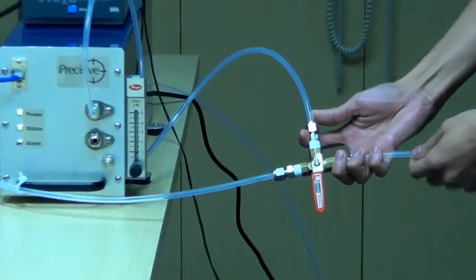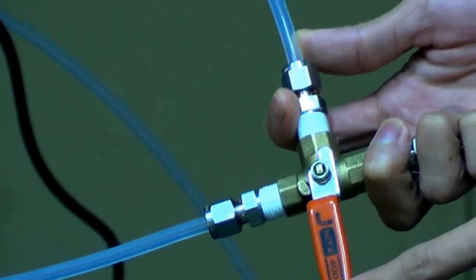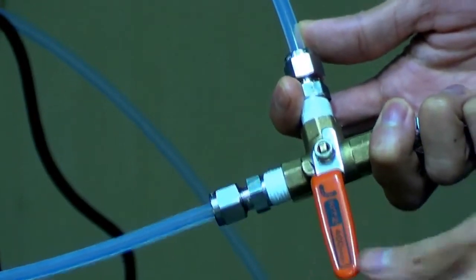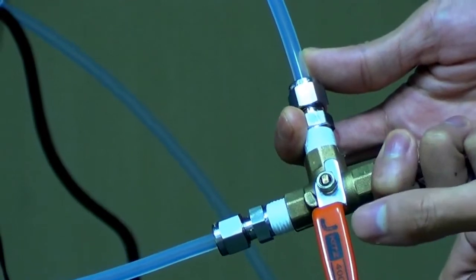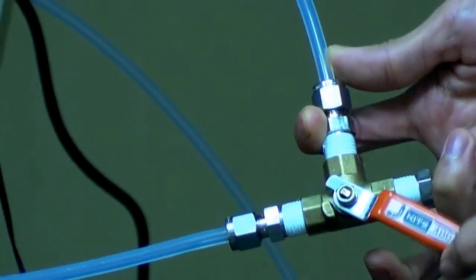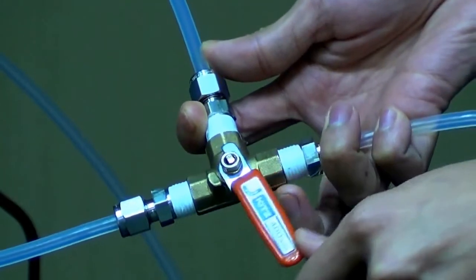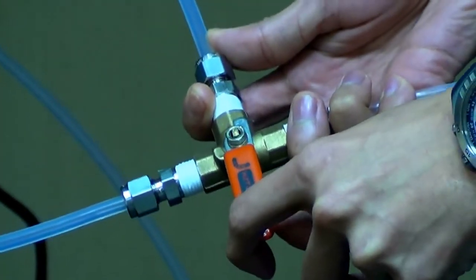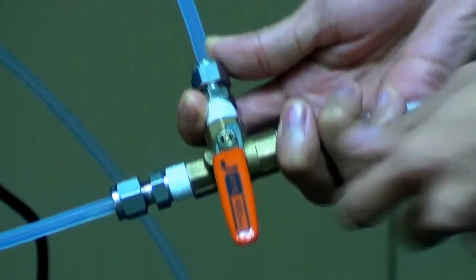The next component will be the three-way valve. As you can see right now, this position is set for the verification gas. Throughout the presentation, we're going to be switching it over from the verification gas to the zero gas, and then back again to be able to demonstrate the real-time capability of our analyzers.